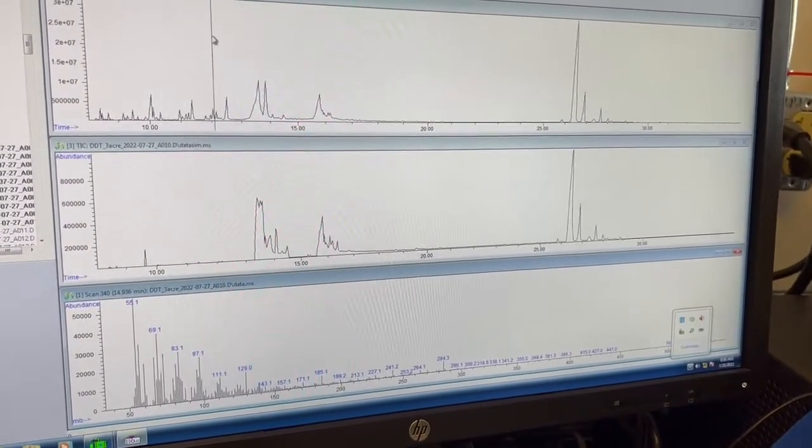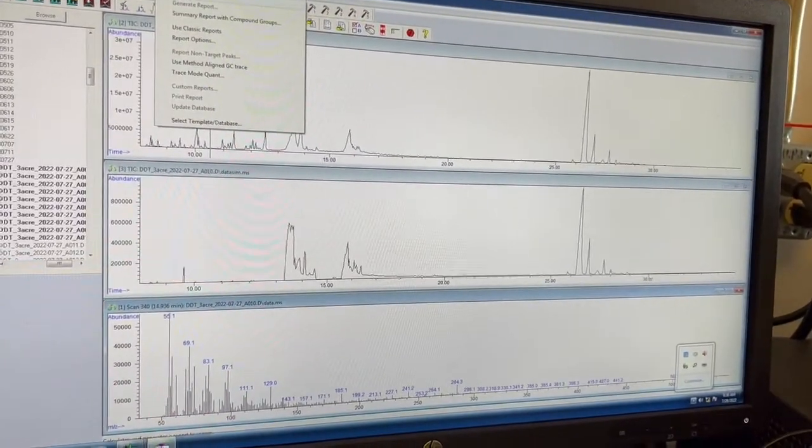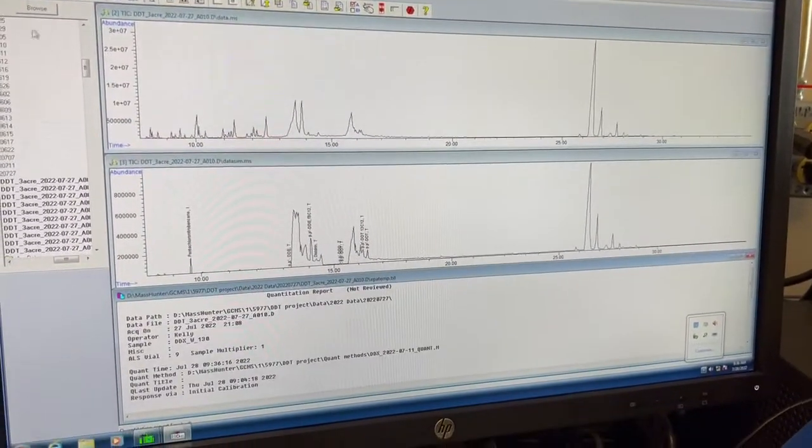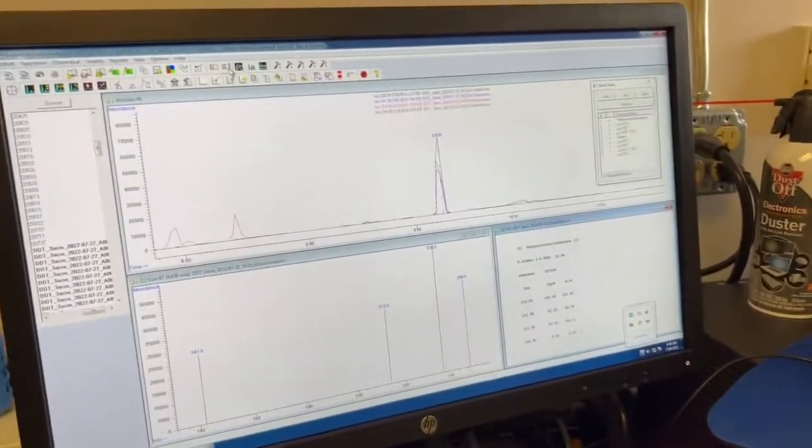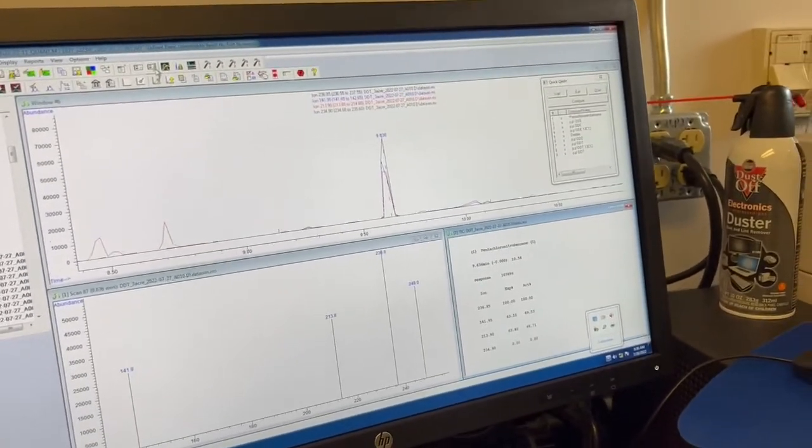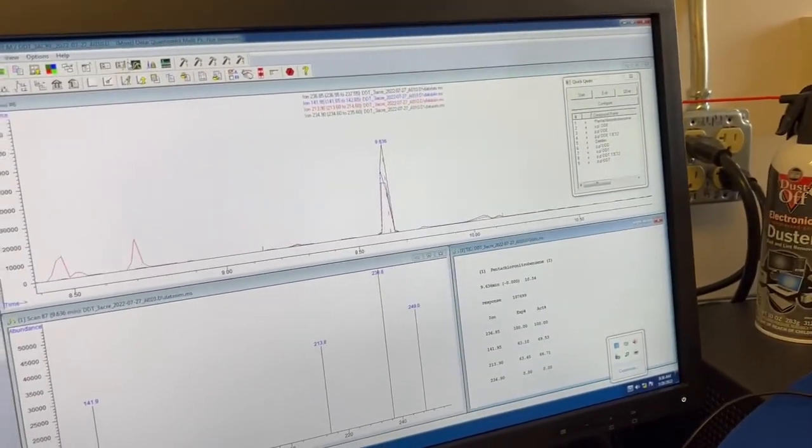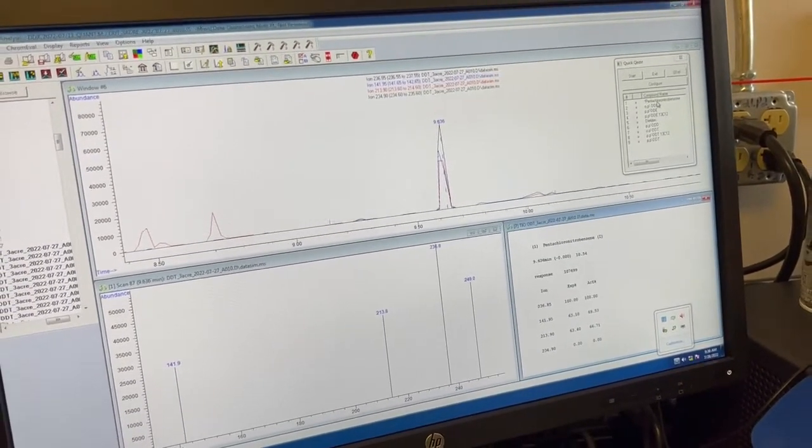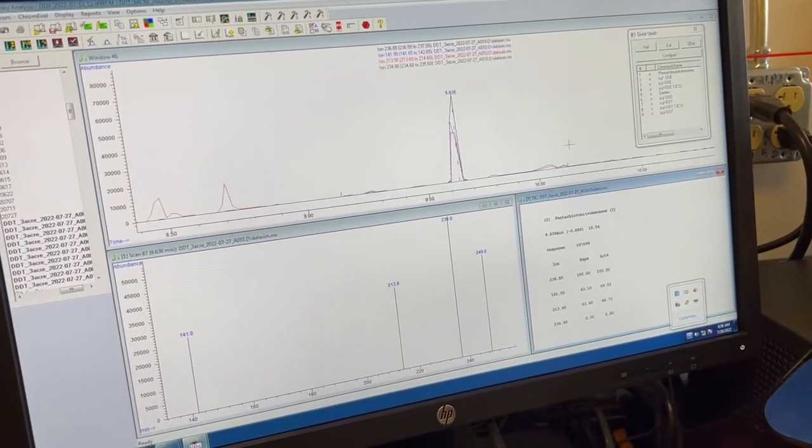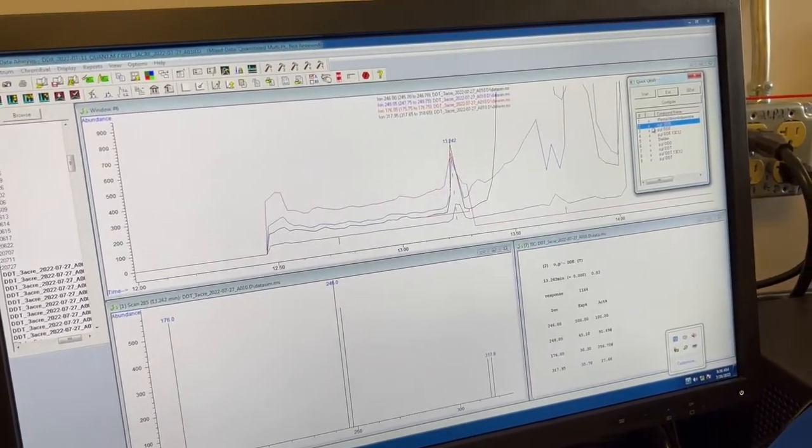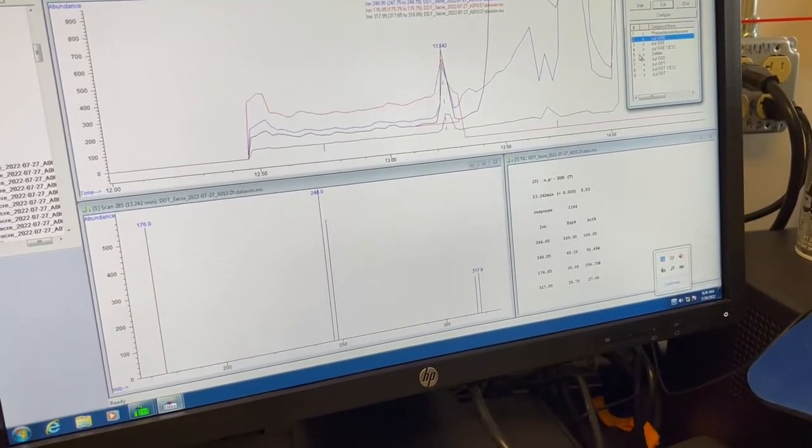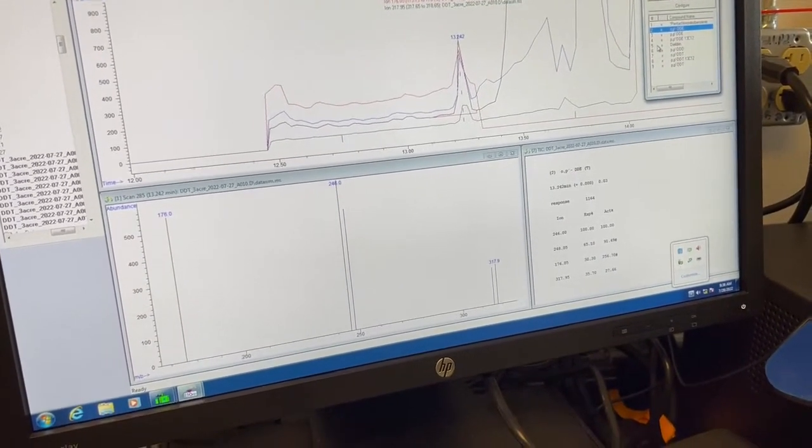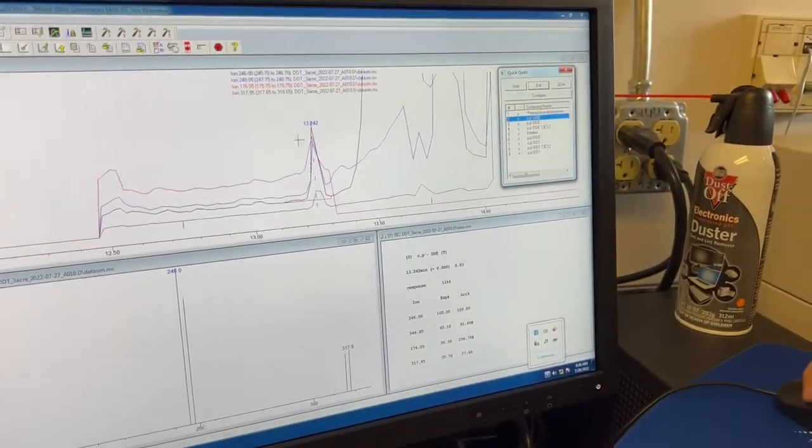I had some problems with this. So I had to look into this. You probably won't. It'll probably be fine. But that's just the difference. And so now we want to quantitate this. We want to do our analysis on our sample. So same thing again, Quantitate, Calculate, and then QEdit. But now the fun thing is our samples are going to get a lot messier. Our peaks are going to get a lot less clean. So we're really going to have to pay attention. So PNCB, this looks good. And then it's far enough clean that everything is clear and easy. PDD. This is like one of the two really kind of problematic ones, I think, with the worm samples. You can see this is teeny tiny and it's next to something that's massive.